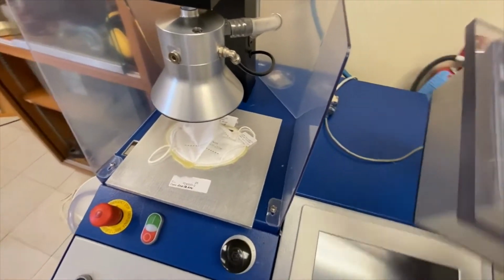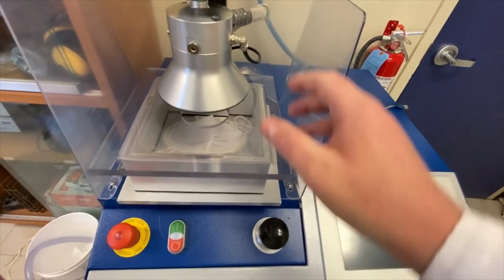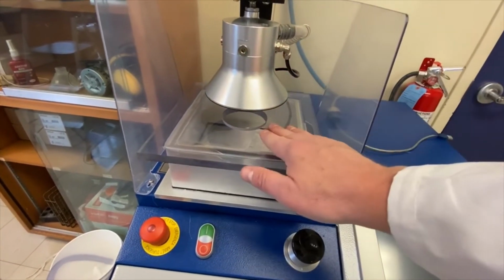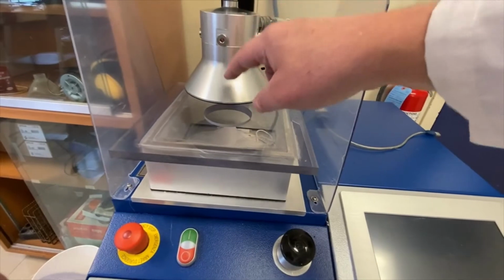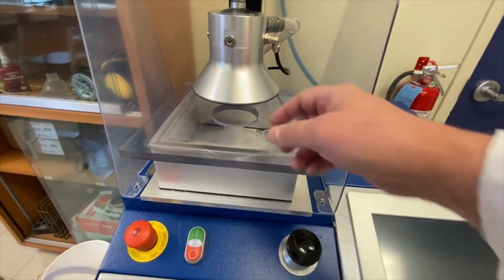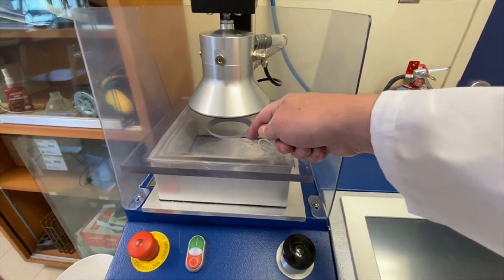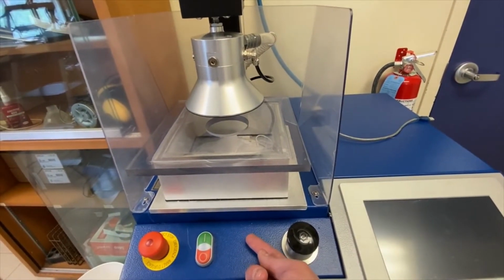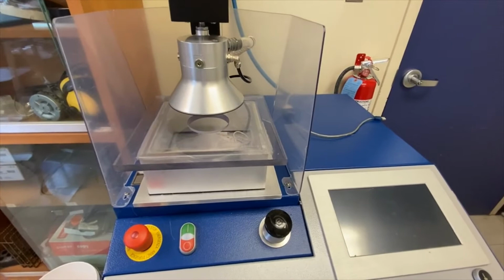And then on top of that mask, we'll put a little chamber. Once all of that's in place, we lower this top piece so that it clamps against the upper face of the chamber. Then we're able to emit an aerosol that contains very fine salt particles from this upper nozzle. A pump draws air through the mask, and we're able to measure the concentration of particles on this side of the mask and compare it to the concentration of particles on the other side of the mask. And using those two numbers, we're able to calculate the filtration efficiency of a mask.